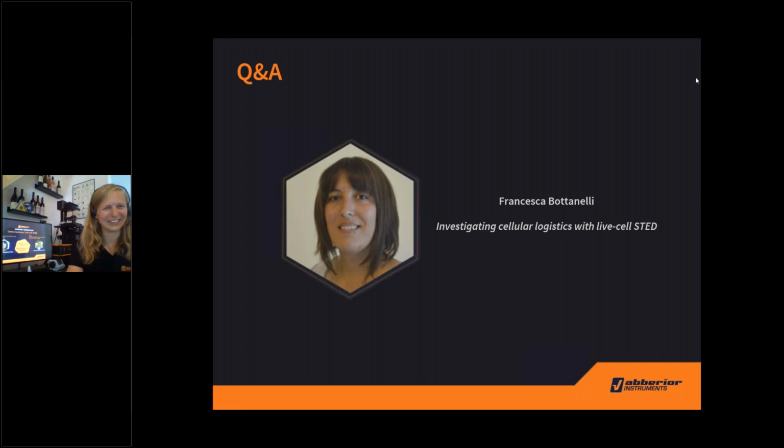Okay, so as a next speaker, I'm happy to introduce to you my colleague from abberior, Florian Grimm. I just recently learned that Flo is actually one of the first employees of abberior who already started to work with the company 8 years ago as a student worker. Flo is a chemist and biochemist by training and is now working on his PhD thesis at abberior, in which he is developing fluorescent and cell-permeable probes. Today, he will talk about membrane-permeable organic fluorophores for live cell microscopy. Thanks for joining us today, Flo. I'm really looking forward to your talk.